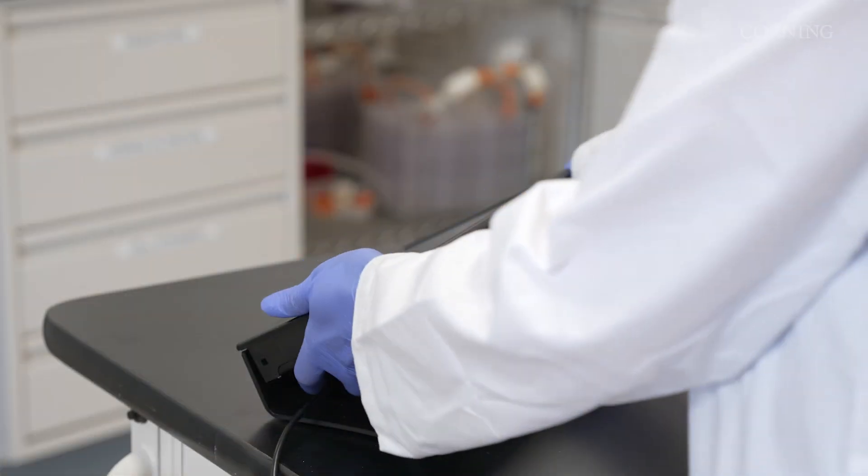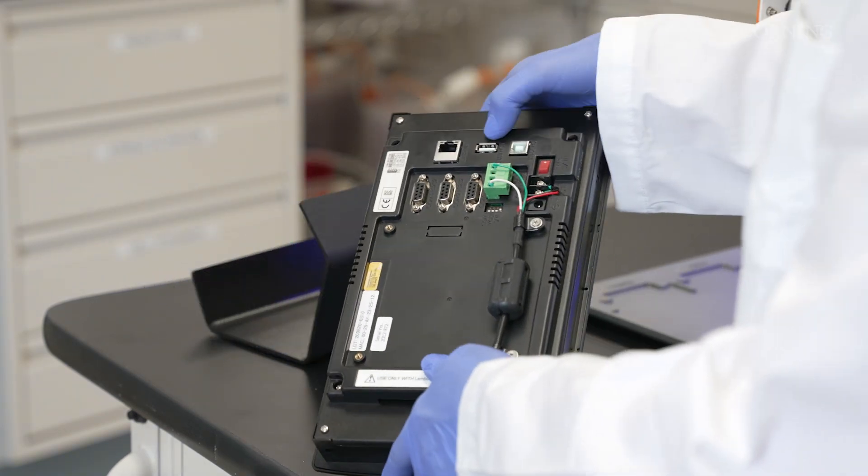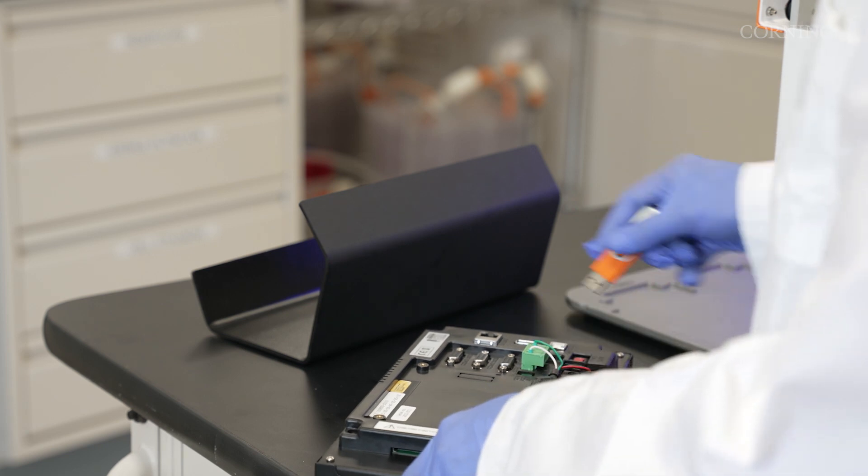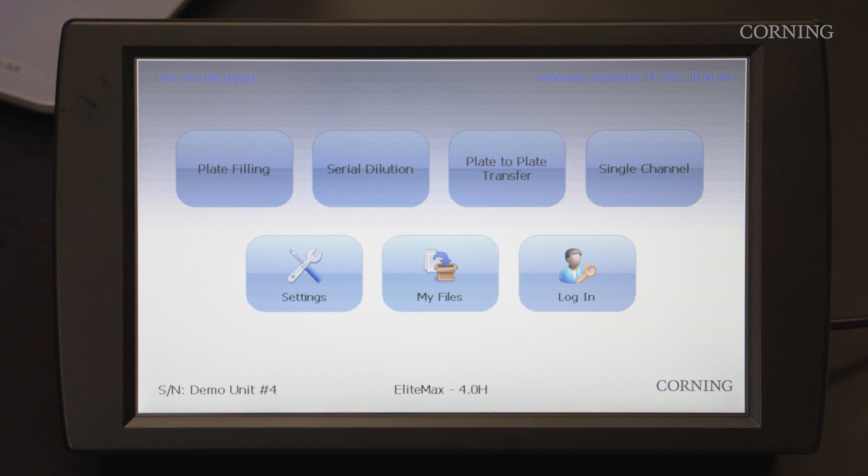Data exchange of protocols is done through the USB host by inserting the USB flash drive in the USB port located at the back of the touchscreen. The Corning Lambda Elite Max Benchtop Pipetter can perform a variety of liquid handling tasks.